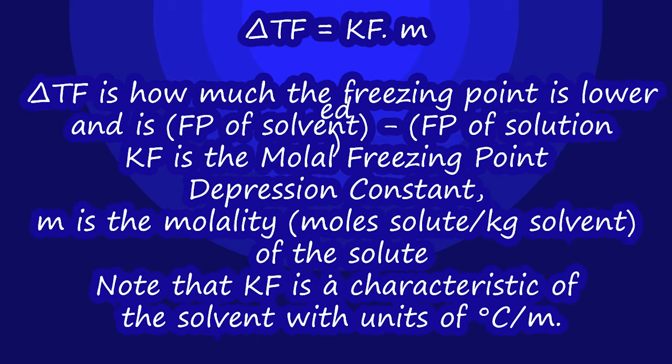The other one, in this experiment, is to use the freezing point depression for a compound that is soluble in our solvent. So we measure the freezing point for the solvent first, then we add the solute, our unknown, and we measure the melting point again. The melting point, or the freezing point, which is the same thing, is going to depress. So the change in freezing point is directly related to the number of particles. The number of particles depends on the mass and on the molar mass. The smaller the molar mass is, the more particles you get.